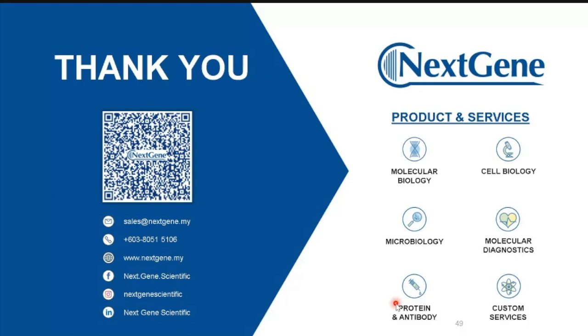After that we shall be able to reply to you whether we are able to pick up the task. Yeah, I'm asking because some of the expression vectors do have a limitation to accommodate the size. Okay, understand. Sometimes the limitation is not because of our gene synthesis technique, but more after we deliver the plasmid to the user. Can you actually deliver the plasmid into your host cell of interest? That will be a challenge, because if your plasmid is too big, sometimes we might have difficulty to transform or transfer it into the host cell.